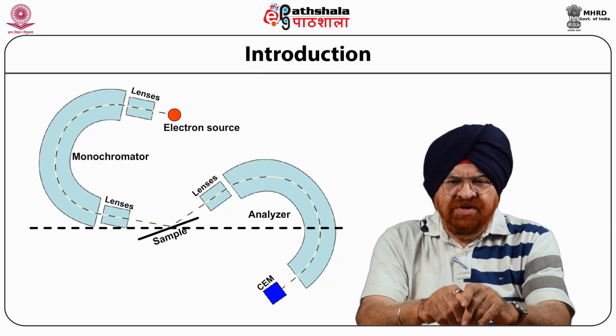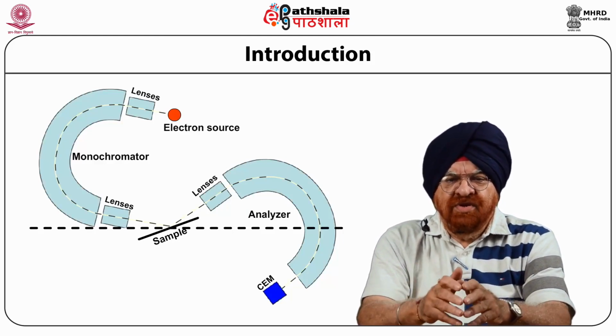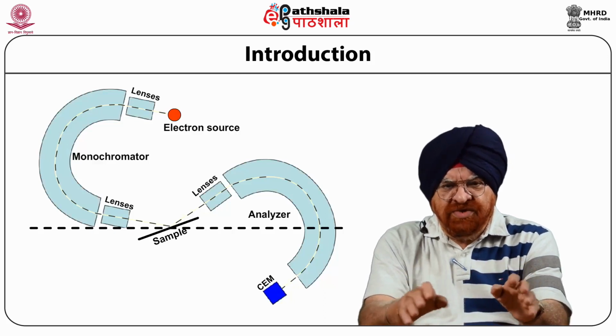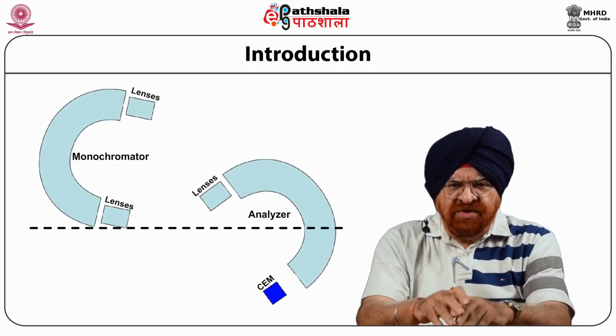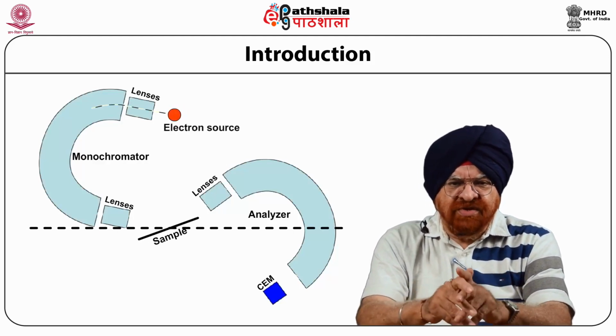Now, low energies are chosen to achieve very high energy resolution, down to or even less than 1 milli electron volt at times, which renders it possible to study the electronic excitations in detail as well as the surface vibrations.